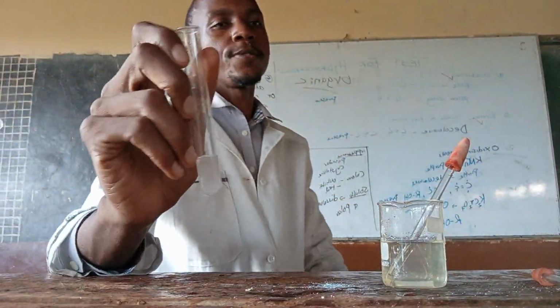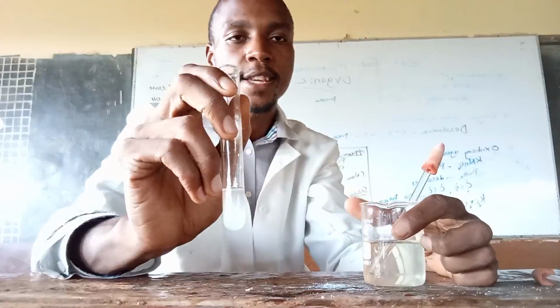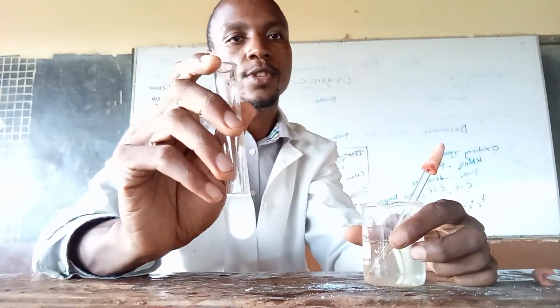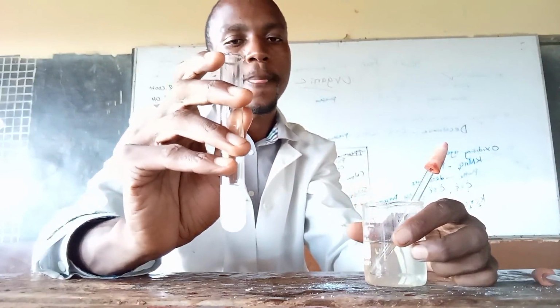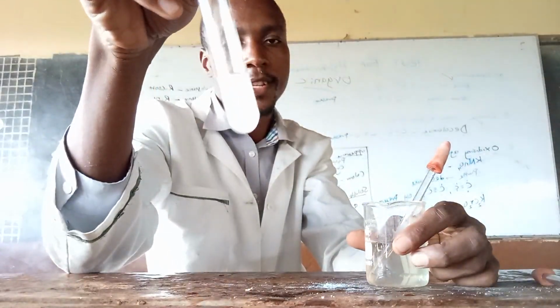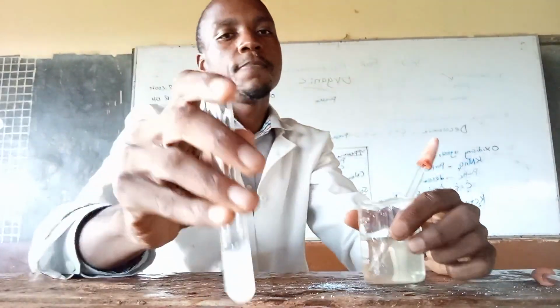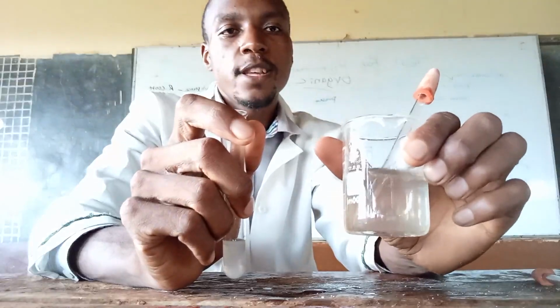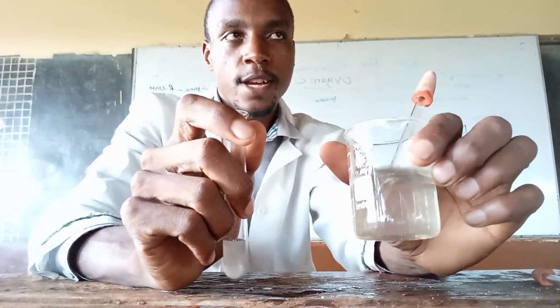So using sodium hydroxide, we now know that this substance here contains magnesium or calcium ions. Remember, we don't use "and" to separate the ions. We use commas or you use "or". A white precipitate formed in few drops, insoluble in excess. That means calcium or magnesium are present. So in this solution here, zinc, aluminum and lead will never appear. We are now dealing with calcium and magnesium only.